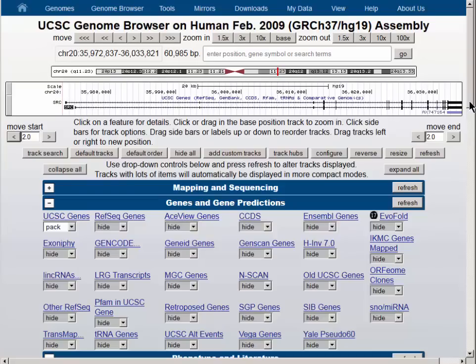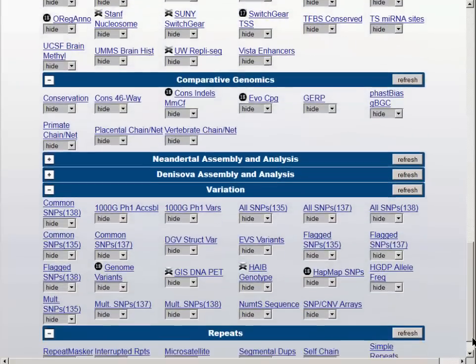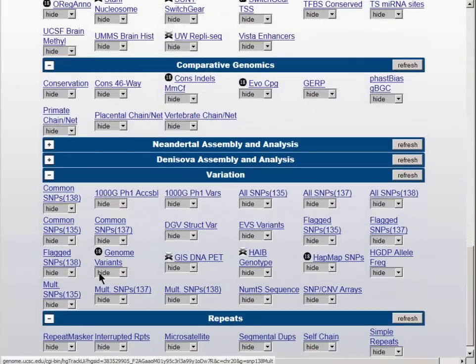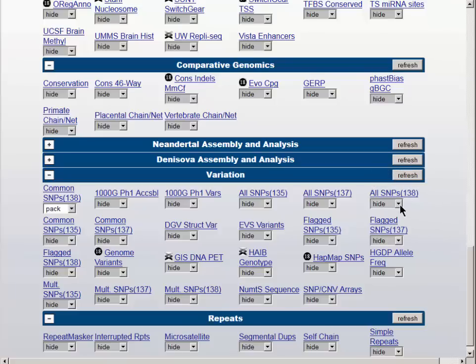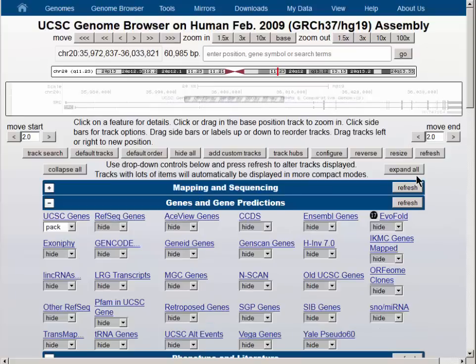The tracks for the single nucleotide polymorphisms are at the bottom of the screen, and we will turn on three of those tracks: the common SNPs from dbSNP version 138, the all SNPs track from the same version, and the flag SNPs track, which are the clinically relevant or potentially clinically relevant polymorphisms. The refresh button then turns on all three of those tracks to pack.